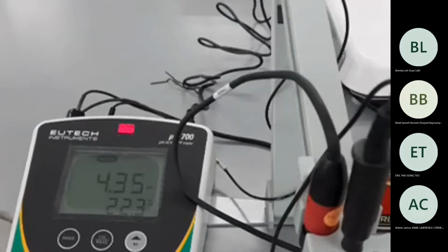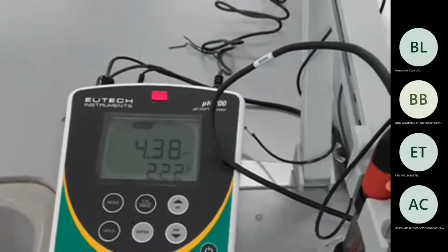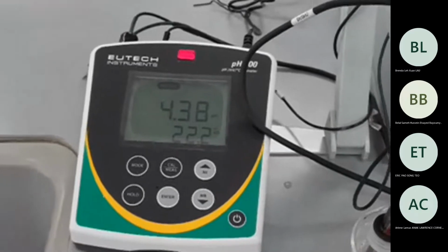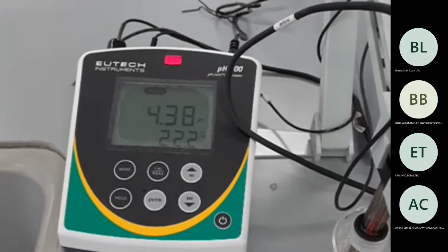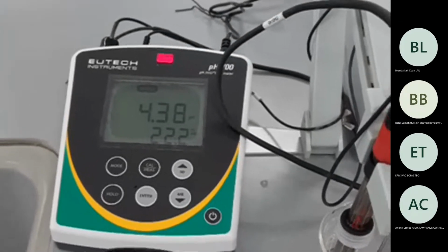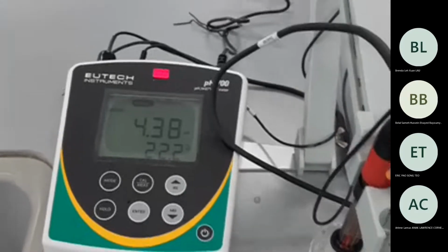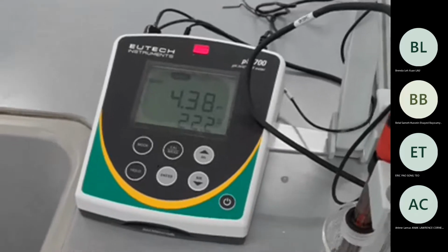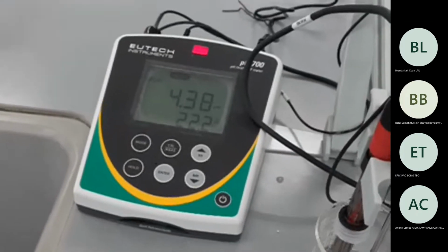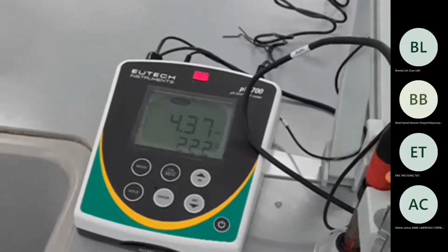That means, even if it is water in the chemistry lab, don't trust it. You see? The pH is well below 7. Quite acidic. Yeah, 4.38. Deionized water or distilled water, you can say. So it's 4.38.